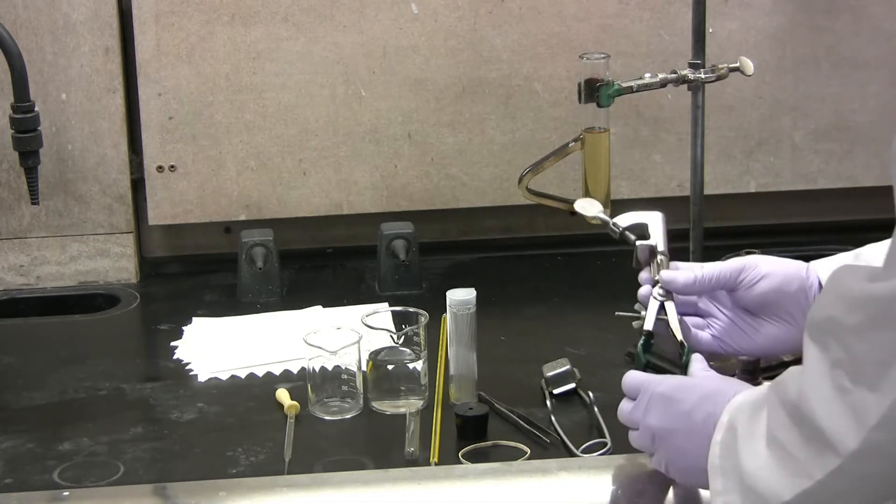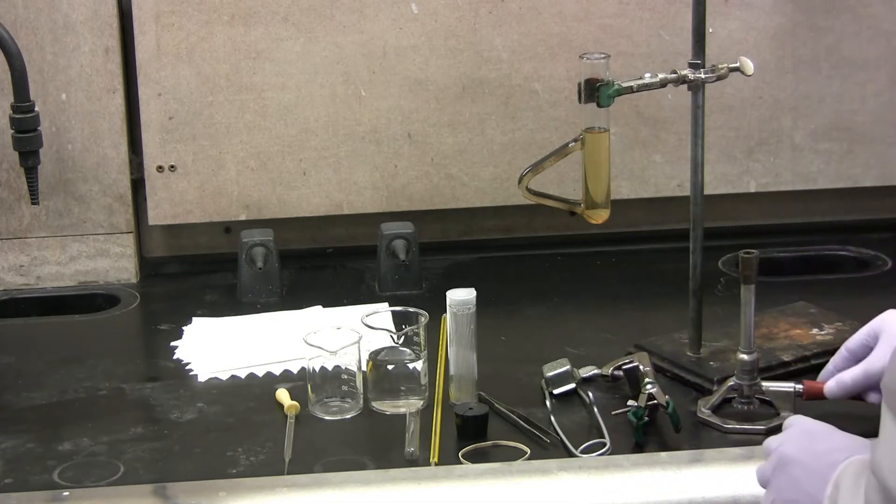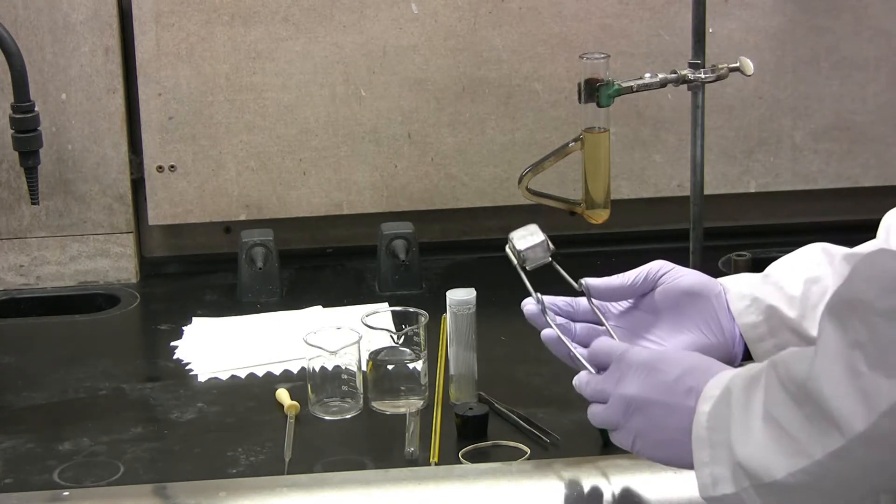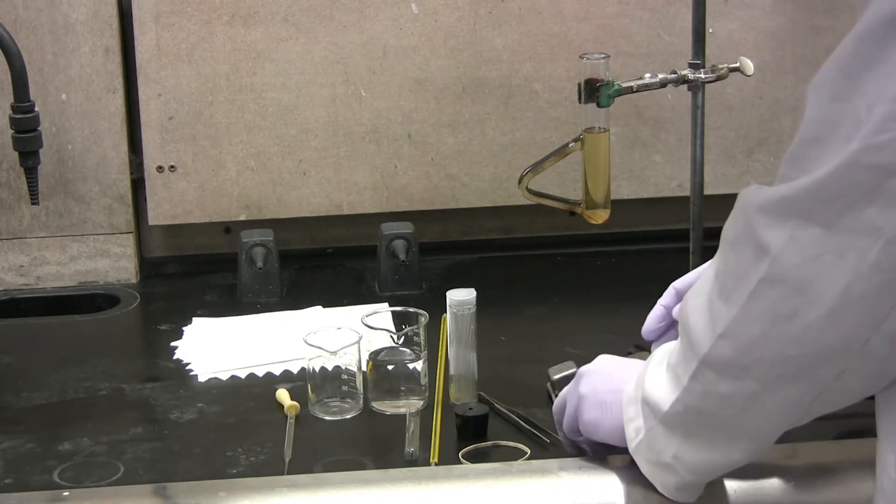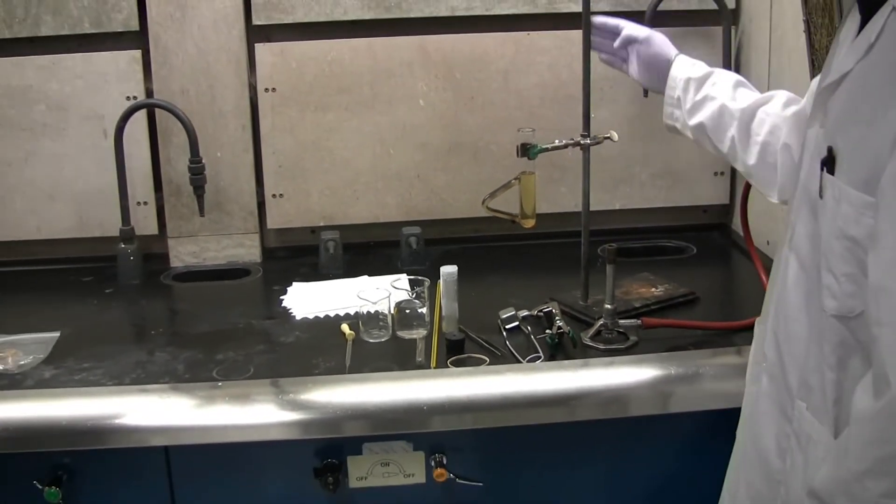Tweezers, a clamp, a Bunsen burner and a striker. You will also require a Thiele tube as well as a retort stand.